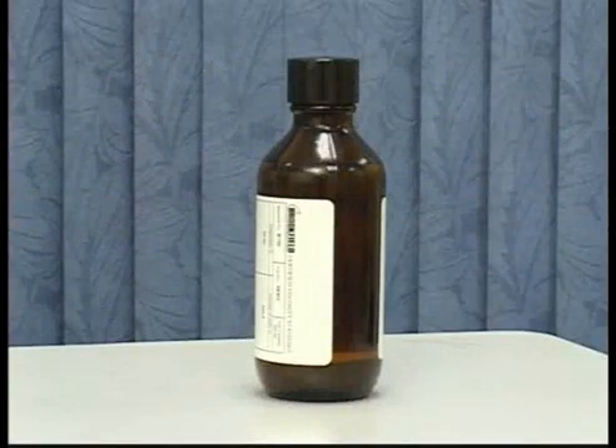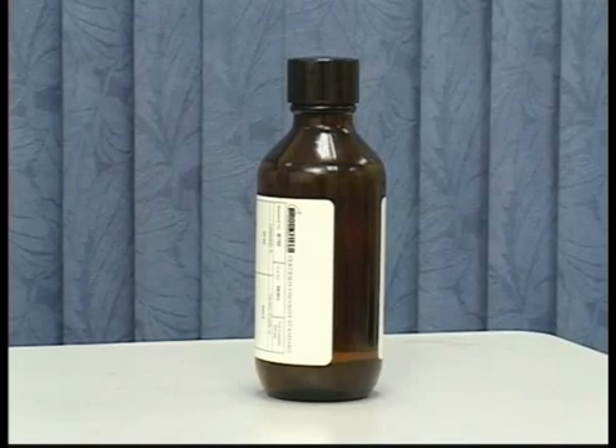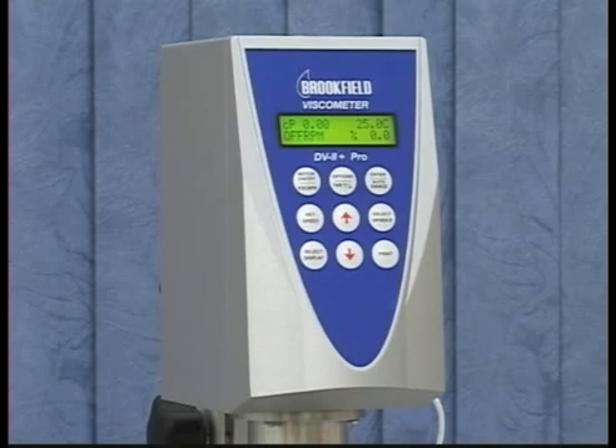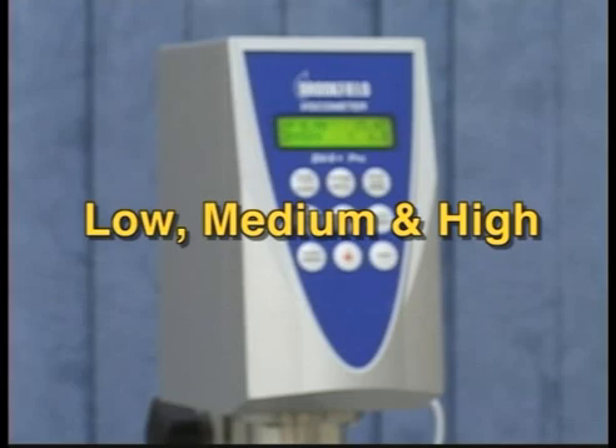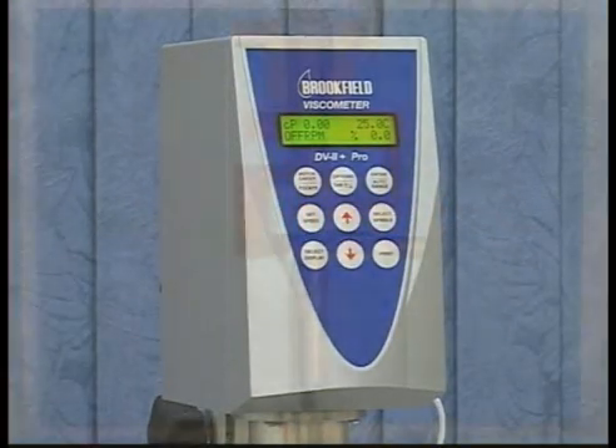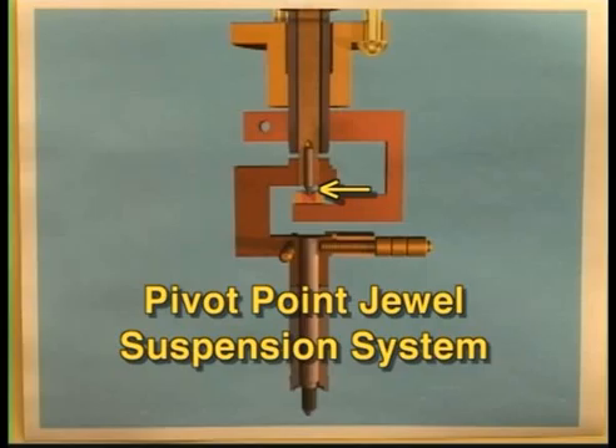You do not need to select a standard fluid based on the viscosity value of your material; however, many customers choose to do so as a simple verification. The calibration routine checks the linearity of the spring on the instrument by using one fluid at three separate speeds to achieve low, medium, and high torque readings. This checks the linearity of the spring and the sensing mechanism of the instrument.